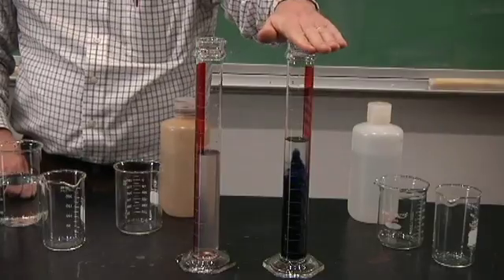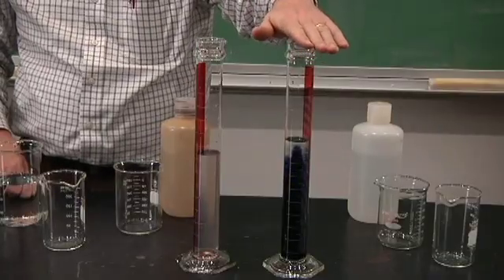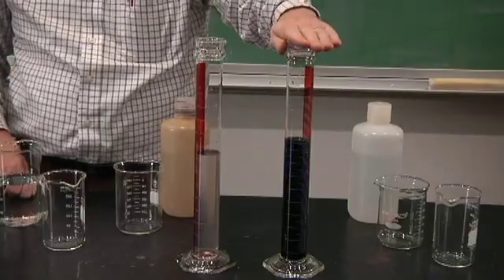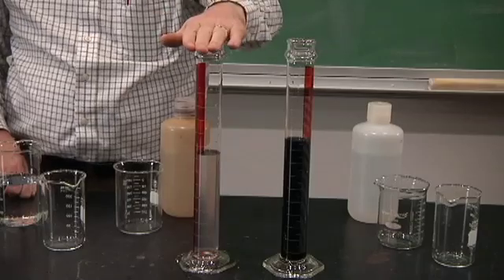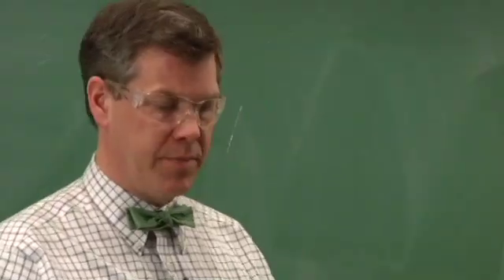So our reaction on this side has already completed. That was the one where I added twice as much of part B. This side with the lower concentration of reactant B has still yet to complete.